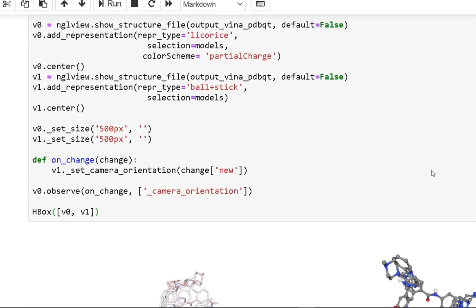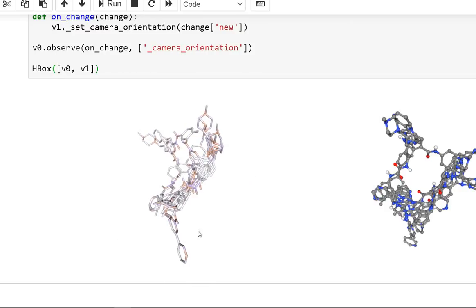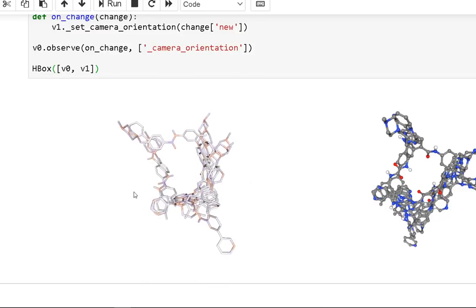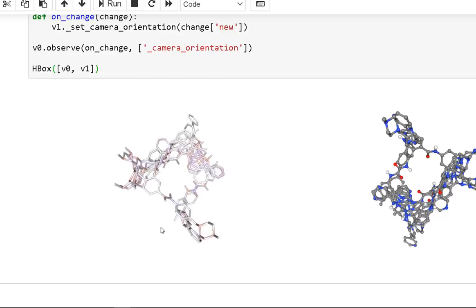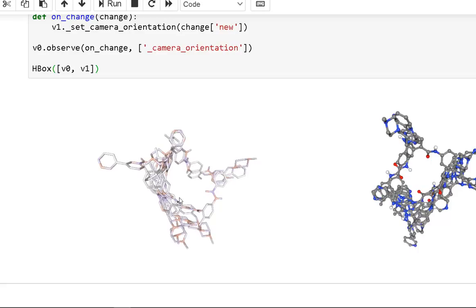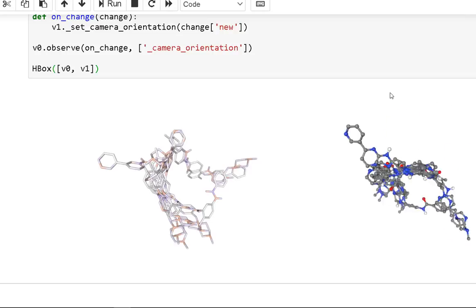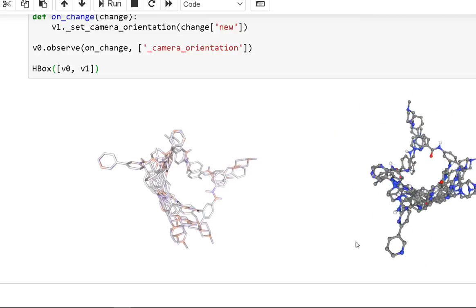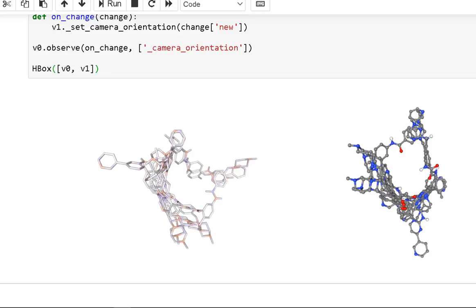For visualizing docking output poses, we use the NGL viewer to visualize the produced docking poses for the ligand. On the left panel, we have docking poses with partial charges, colored atoms, and licorice representation. On the right panel, we have a ball-and-stick illustration of docking poses with atoms colored by element.